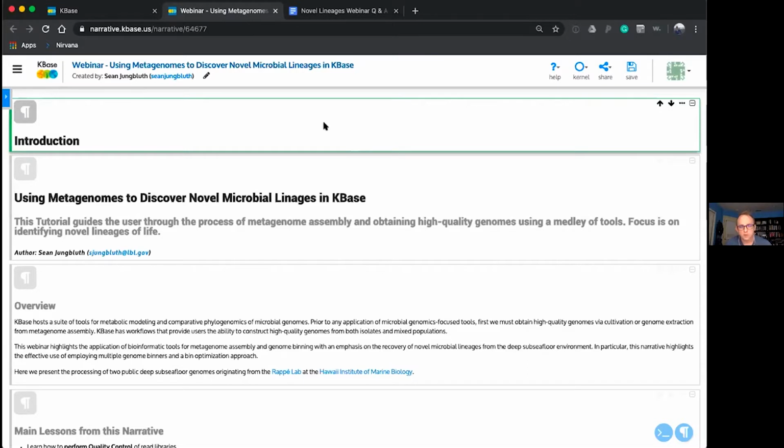Okay, so hello everybody. I'm Sean Jungbluth. I'm a data scientist at Lawrence Berkeley National Lab working in the KBase group. And today I'm going to be presenting a webinar, a workflow to use metagenomes for the purposes of discovering novel lineages.